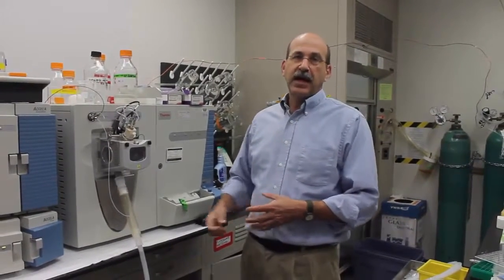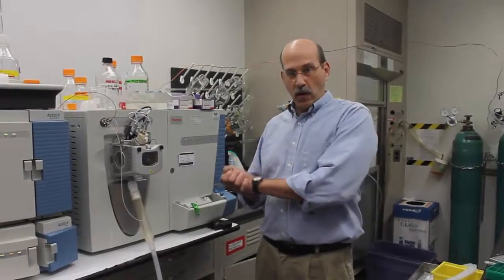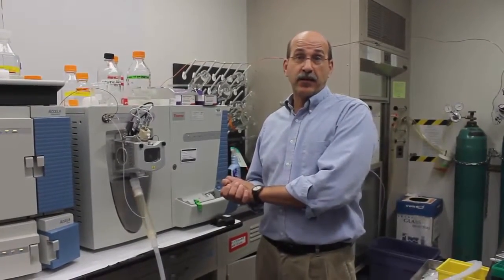Another class of compounds that we analyze right now are bile acids. Bile acids are produced in the liver and are transferred. They are part of what we call our gut microbiome. So we can differentiate some disease states based on the ratios of some of these bile acids. We've developed an assay to monitor these bile acids not just in the gut fluids, but also in the tissues that produce them and the tissues where they wind up. We hope to be able to differentiate and get some disease biomarkers from some of this work.